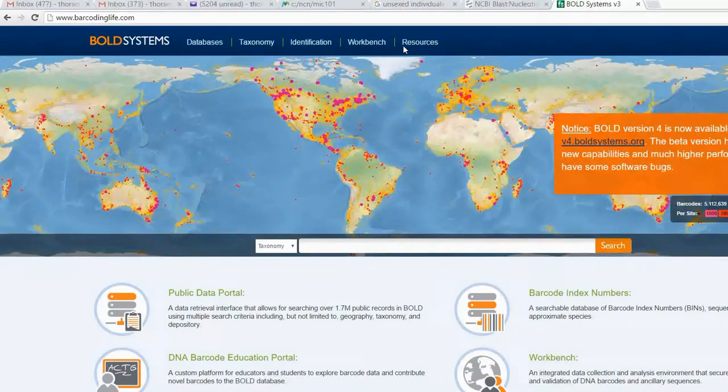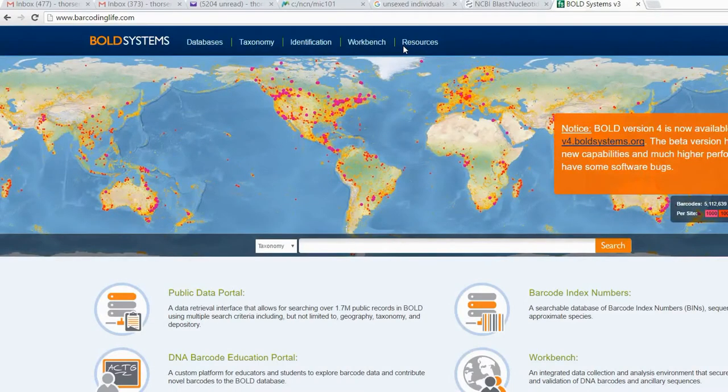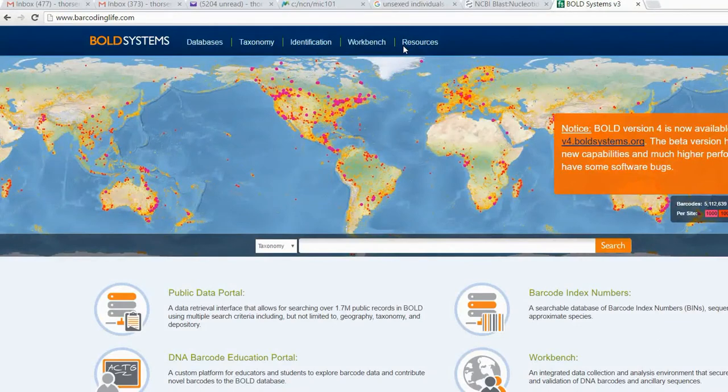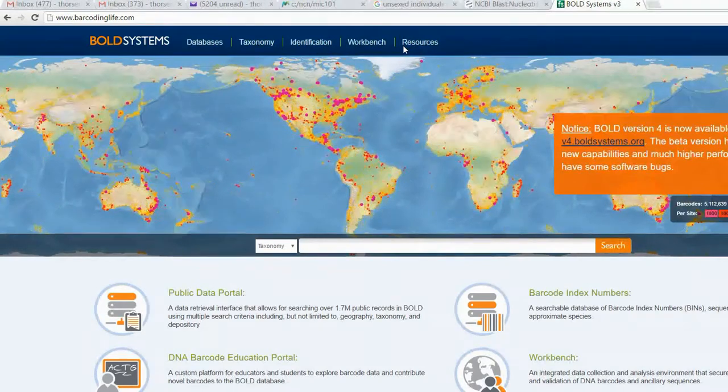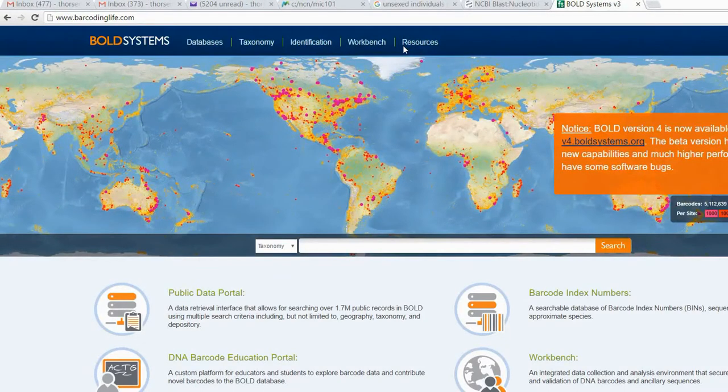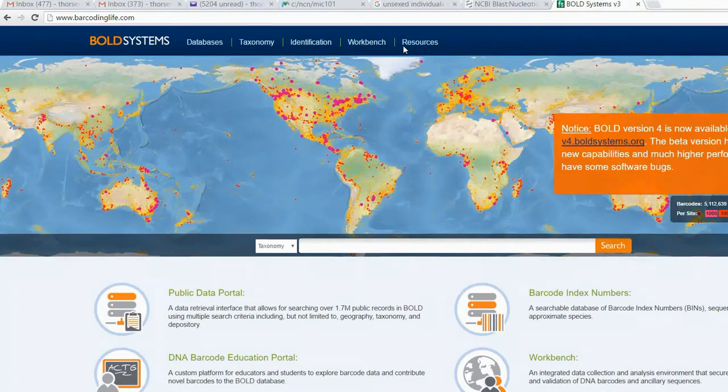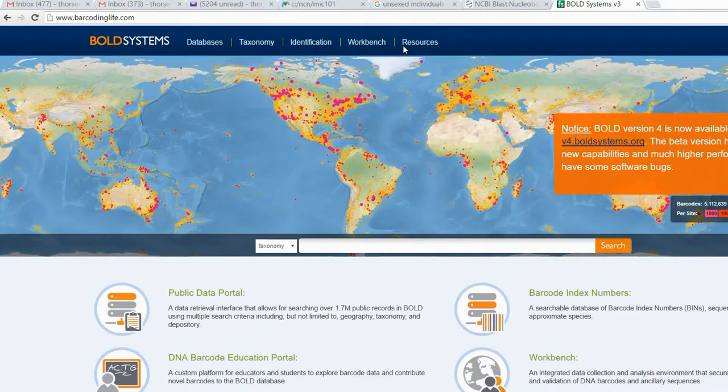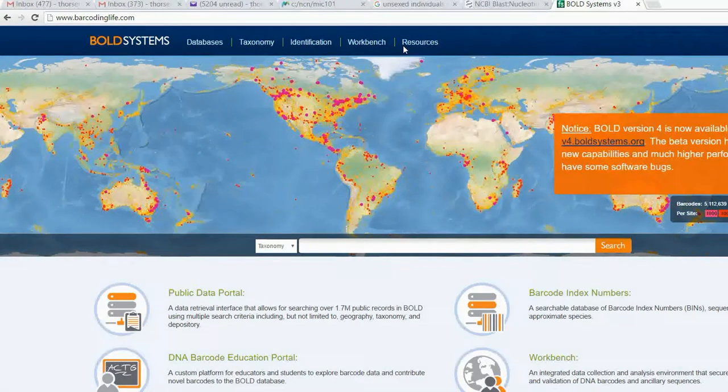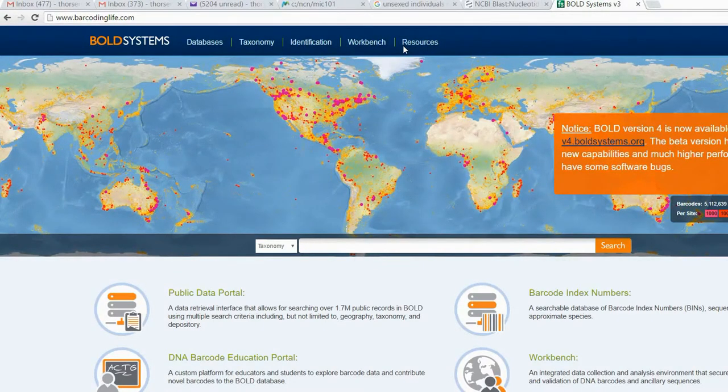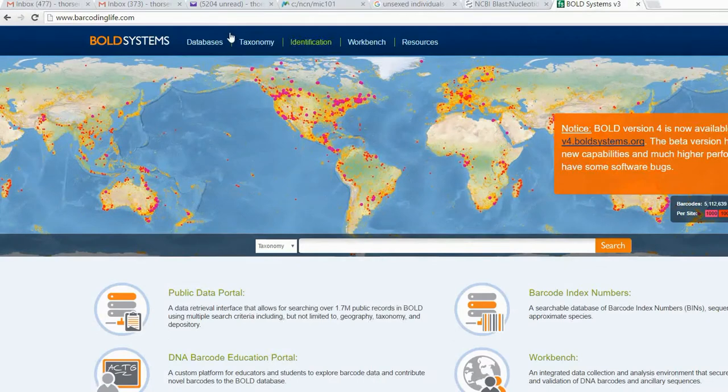So here, all the sequences in GenBank - all the sequences here are also in GenBank. But here they also have more data for the specimen. Not only the similarity, they show you the picture of the specimen. So just an example.